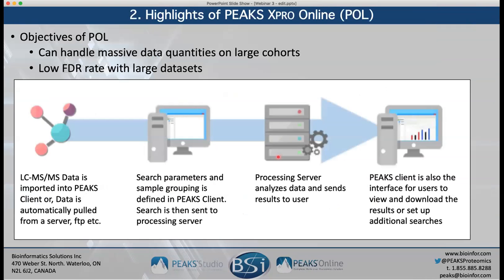Okay, so what is PEAKS Online? PEAKS Online is essentially a server-based search engine. What happens is your processing server is placed on either a high-performance computing cluster on your site or somewhere on a system like AWS, Amazon Web Services, or Google Web Services in the cloud.